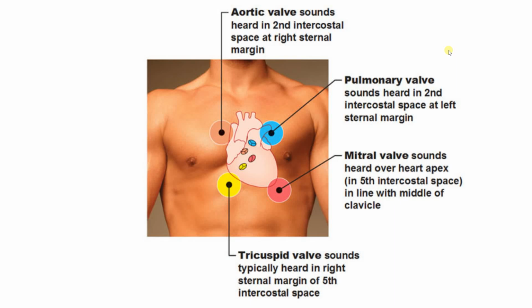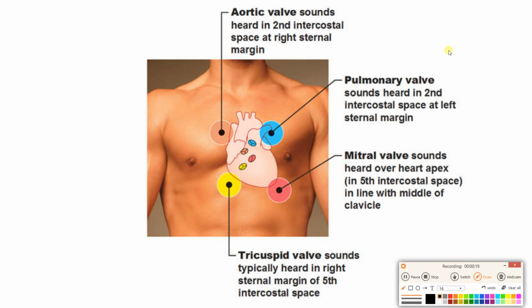Hey, what's up, everybody? We are moving on to a brand new lab here. We're going to be working on doing some measurements and doing some math with those measurements. So, obviously, we've got a heart situated in its anatomical position in the thoracic cavity there.